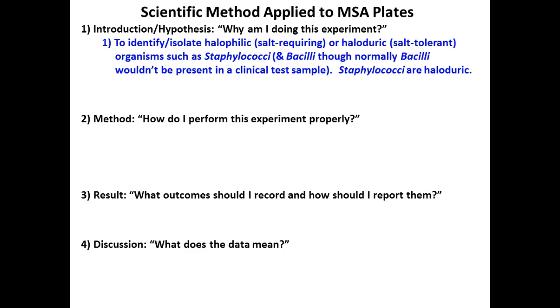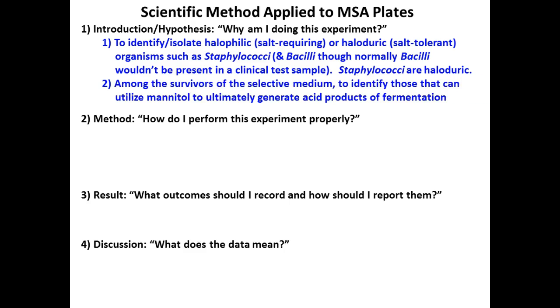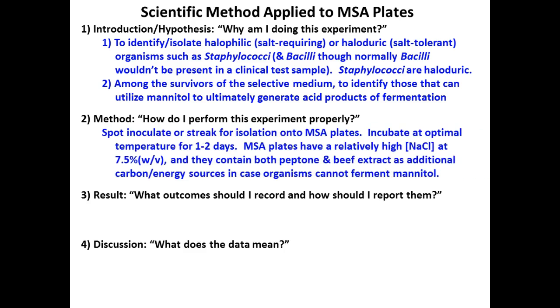And again, some of our bacilli can be salt tolerant, though we wouldn't normally see those in a clinical lab. Among the survivors, if it grew, then we can ask the next question: can it utilize mannitol, right? And that we detect by the color change in the media. So this is pretty easy, right?